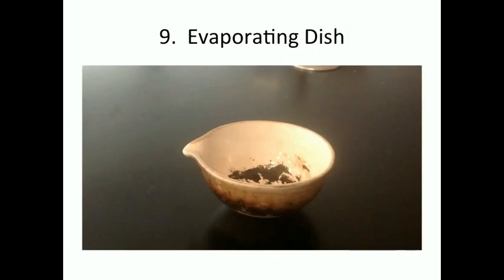This is an evaporating dish. It's used to heat solids or liquids. You can also evaporate water or liquids off of a reaction by leaving it open to the air.